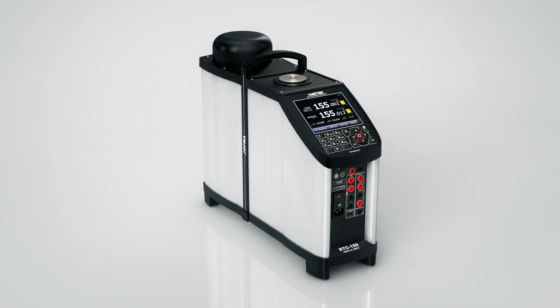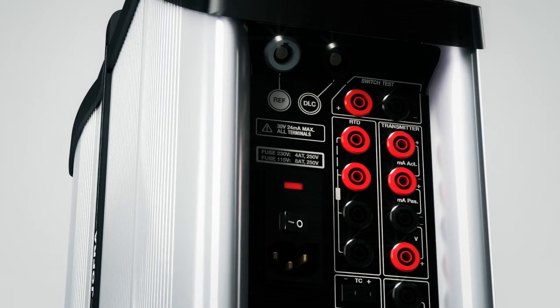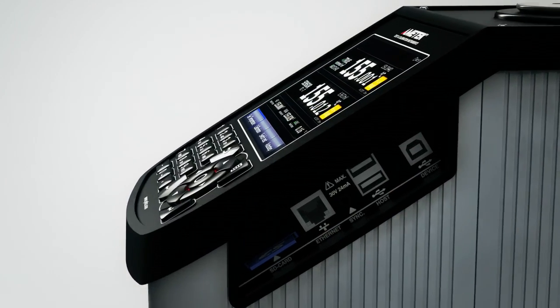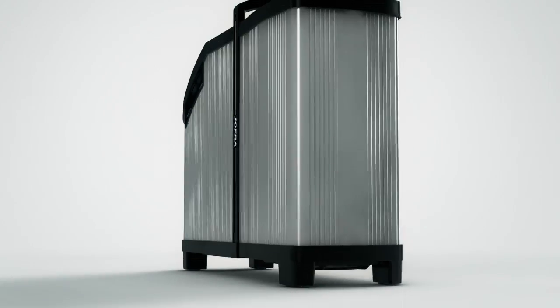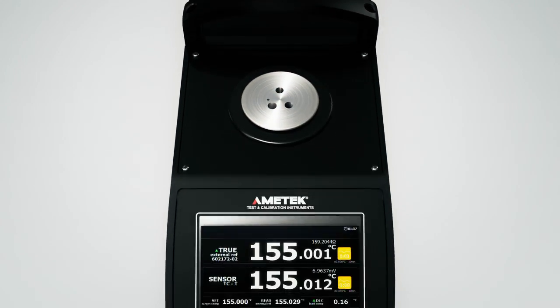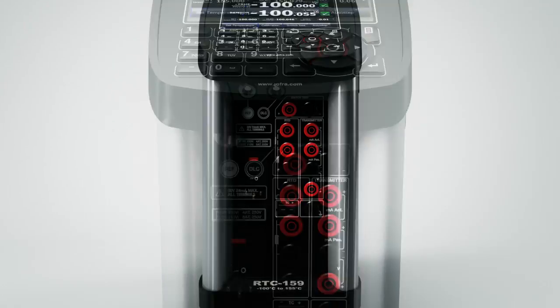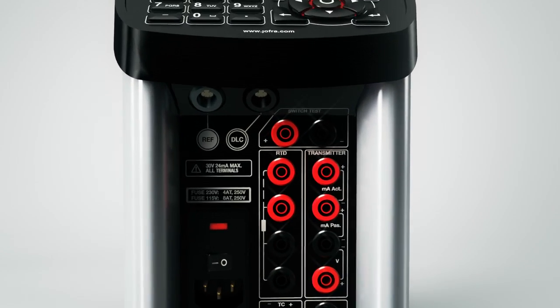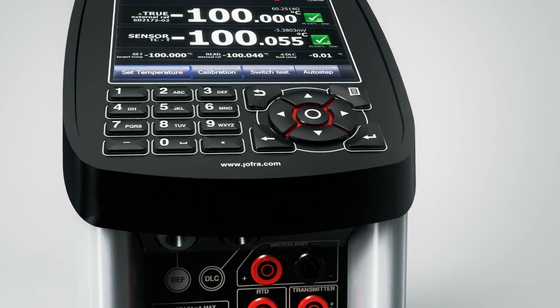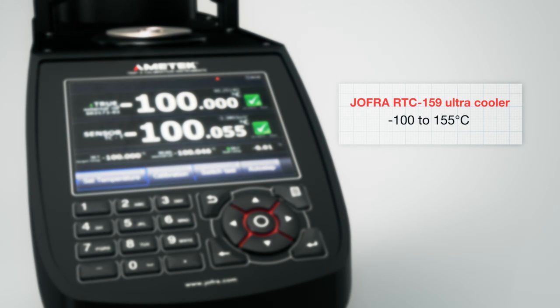Ametek Test and Calibration Instruments introduces the JOFRA RTC-159 Reference Temperature Calibrator. Thanks to Ametek's well-proven, patent-pending solution based on Stirling technology, the RTC-159 is the only dry block with a temperature range from minus 100 to plus 155 degrees Celsius. You can meet all of your temperature calibration needs in this one unique unit.